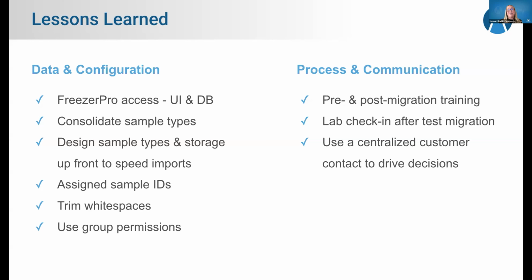And then I love to see that Ankit brought this up as well. We use those grouped permissions to really allow each lab to have their own access and control over their system.